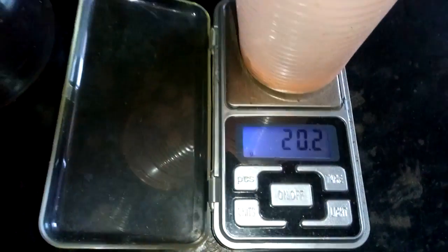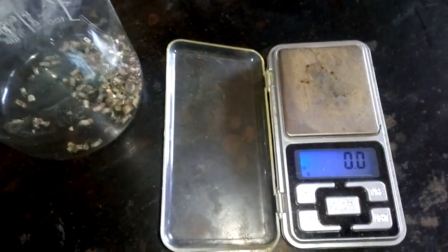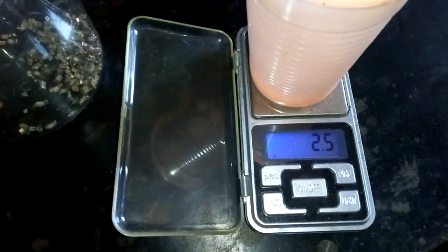So now we gonna see how much we got. 20.2 gram. And empty cup is 2.2 gram. So we got 18 gram.